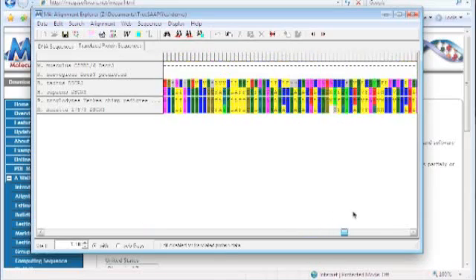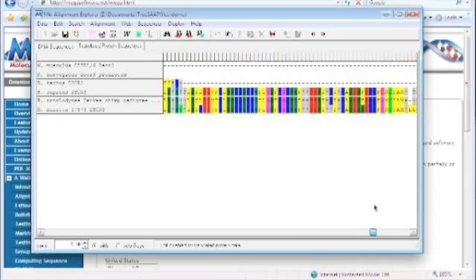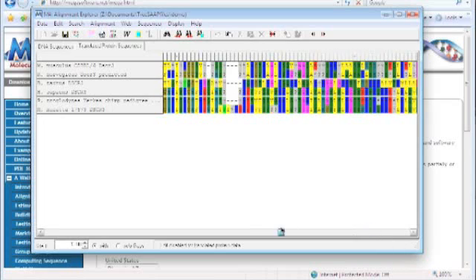You can notice that these bottom three, which are the primates and the human, they align a lot better than the rest — the cow and the mouse and the rat.